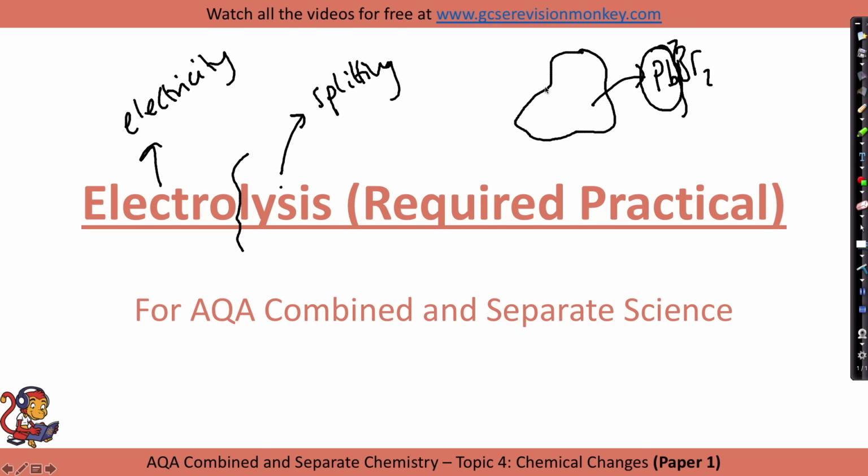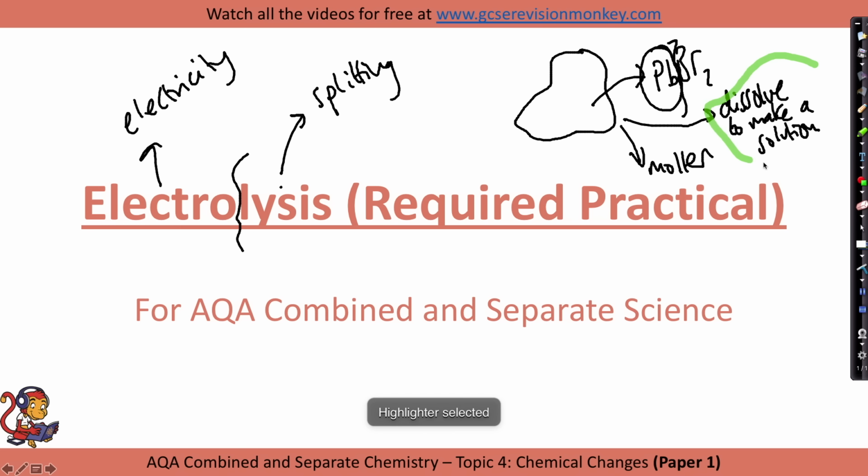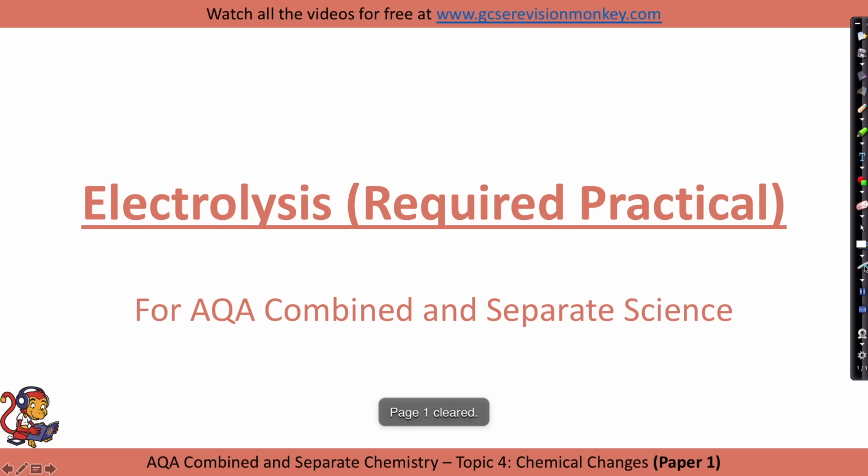Now, whilst it's a solid, the ions cannot flow, so you can't split it up. So what you'd have to do is either heat it up so it's molten, or dissolve it in water, if it will dissolve, to make a solution. With regards to your required practical, it's this one here that we're concentrating on: when a substance has been dissolved to make a solution, not when a substance has been heated up to become molten.